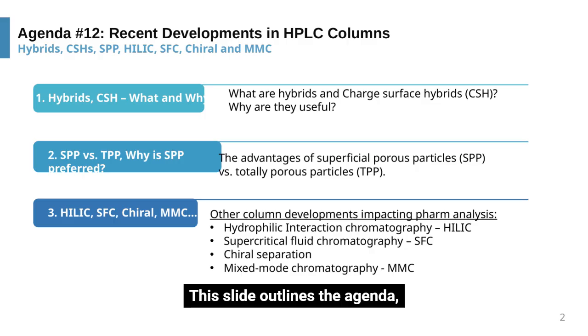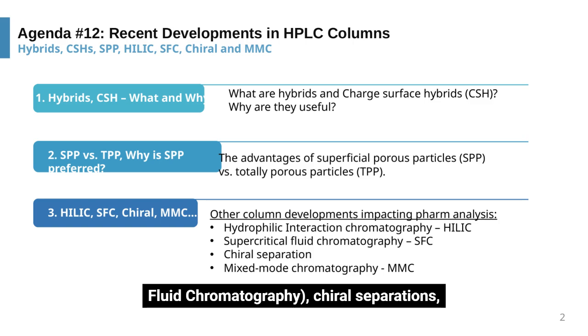This slide outlines the agenda, focusing on recent developments in HPLC columns. We'll cover hybrids, CSHs (charged surface hybrids), SPP (superficially porous particles), HILIC (hydrophilic interaction chromatography), SFC (supercritical fluid chromatography), chiral separations, and MMC (mixed mode chromatography).